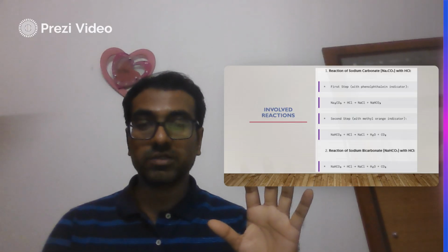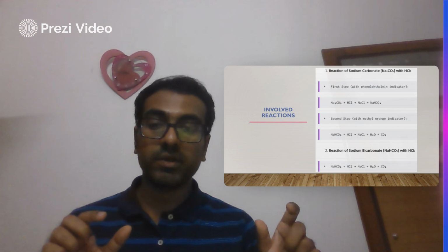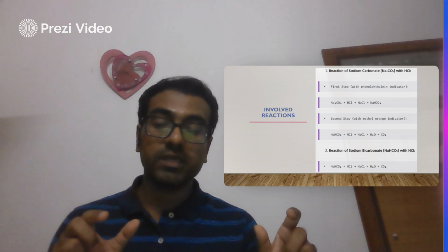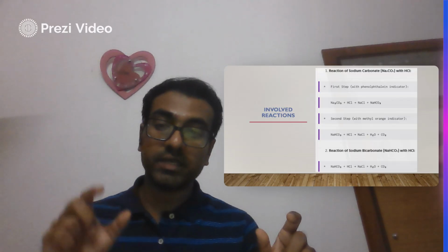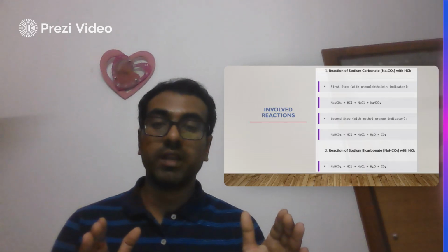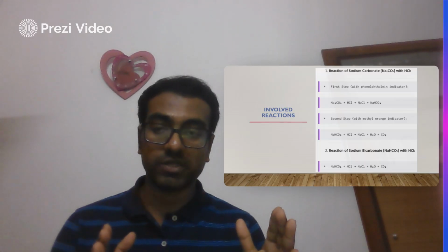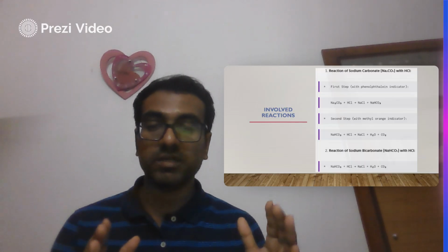Now think about the solution. What do we have now? We already had some sodium bicarbonate, and now we have some sodium bicarbonate that is coming from the sodium carbonate. And now that would be the next step of the experiment, or the titration step, I should say.